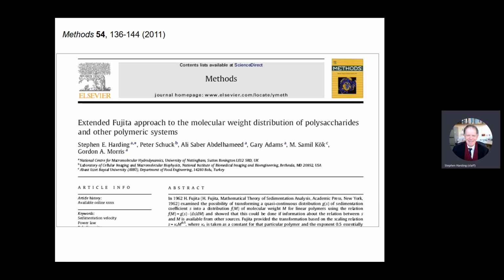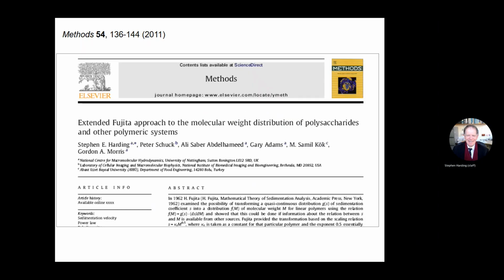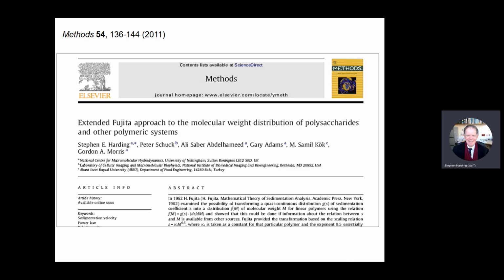That's just a bit of research we did a few years ago. This is all based on basically spherical types of conformations, but we extended this to cover general conformation types of polymeric systems, including linear types of molecule, rod-shaped, coil shapes.